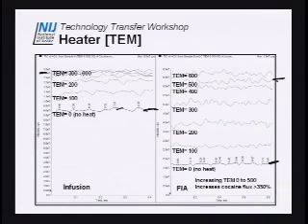But you can see a huge difference, a 350% increase from here to here. So you can see that temperature makes a difference. Why does temperature make a difference? Remember, the middle stage in ion formation is what? Desolvation and droplet fission. Turning the heater up in there helps that mobile phase, methanol water, leave. Your volatile buffers are leaving, the droplet's shrinking faster, and when it shrinks, it breaks apart, and you get your little ions, your small droplets, and they shrink, and then your ions pop off the surface. Putting the heater up facilitates doing that.